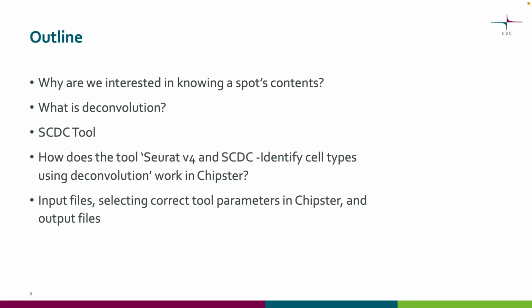After this, we will describe how the tool Seurat version 4 and SCDC identify cell types using deconvolution works in Chipster. And finally, we will list the input files, select the correct tool parameters in Chipster, and list the output files.